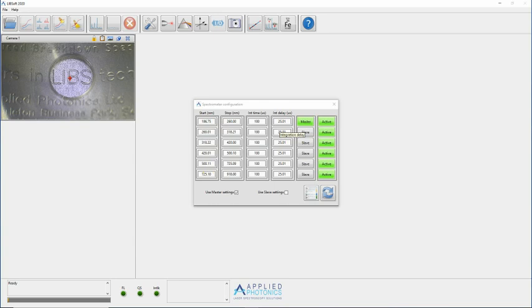One of the channels is designated as the master channel, and the remaining channels as slaves. The trigger signal from the laser Q switch is connected to the master channel, and the slave channels are synchronized to this master. The master channel is factory set as the channel with the lowest wavelength range. It is therefore important that this channel is configured as the master in the spectrometer configuration window.